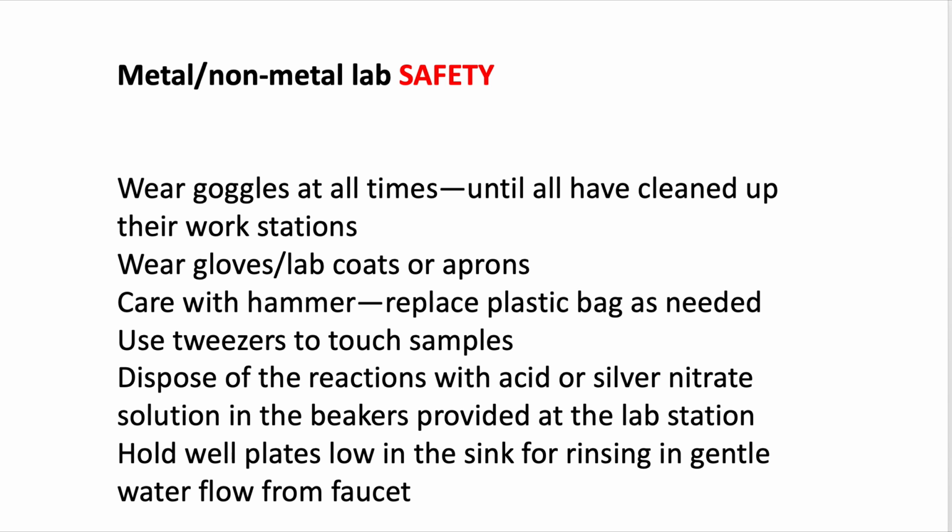And in the lab, pause this to read it carefully and indeed read it a second time. Goggles, gloves, aprons, materials that we're using, use tweezers to touch the samples, the hammer, and disposal, still keep your goggles on all the time, and dispose of the liquids in the beakers provided. And if you're rinsing the well plates, hold them low in the sink in a gentle water flow.